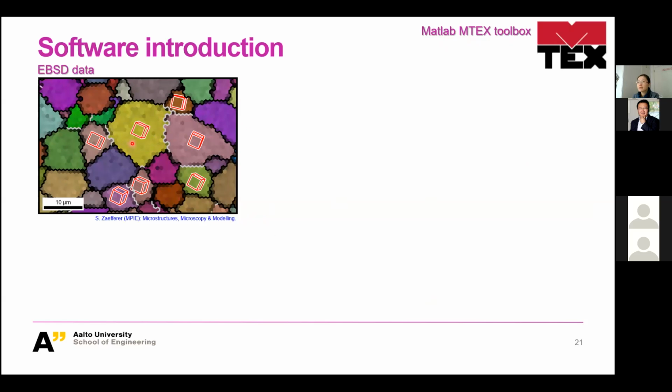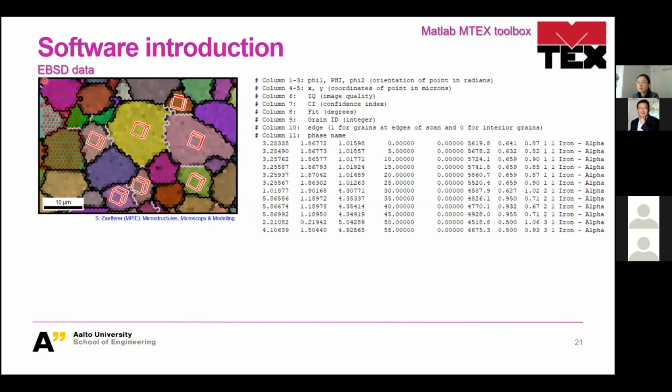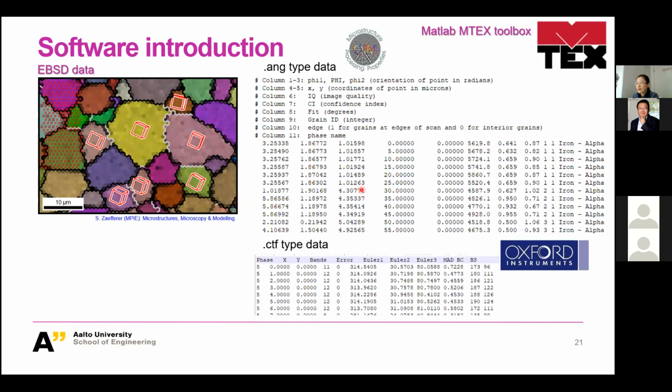And you can see the pixels here correspond to one measurement point. On each measurement point, you can obtain this kind of data. It's a series of data, obtaining a lot of information here. And if you have a different EBSD measurement system or detector produced by different companies, or if you set a different data format as the output, you will get different kinds of output data.